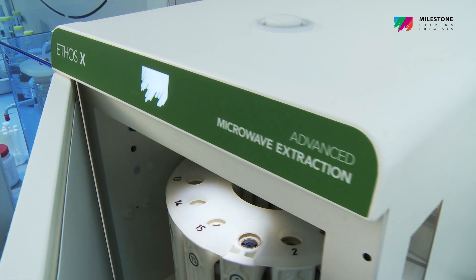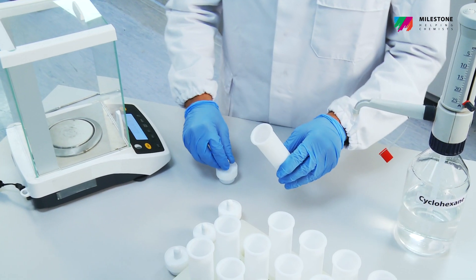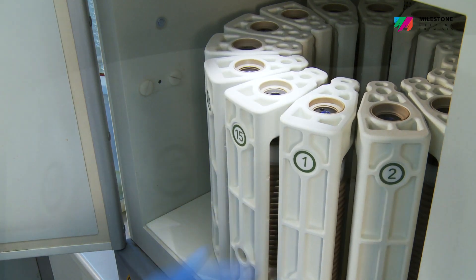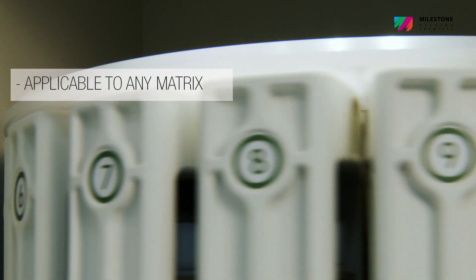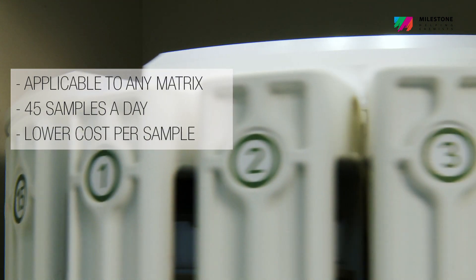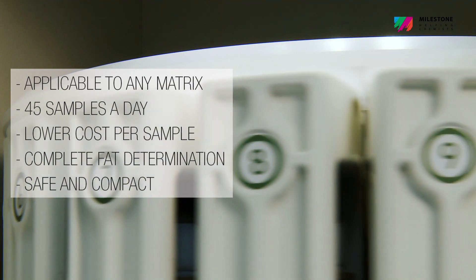In the Ethos X, hydrolysis and extraction are done in a single step and in less time, ensuring higher productivity and better workflow. The Ethos X method for total fat determination is applicable to any matrix, enables the processing of 45 samples a day, ensures lower cost per sample, offers complete fat determination, and is safe and compact.